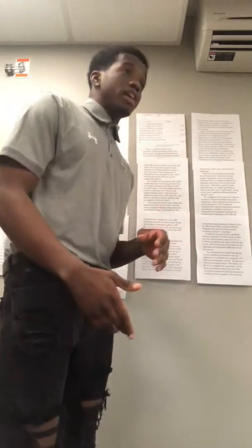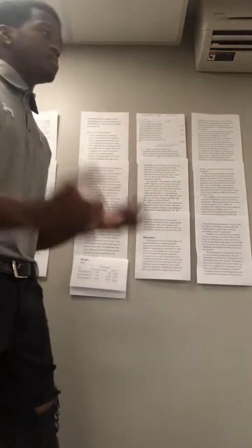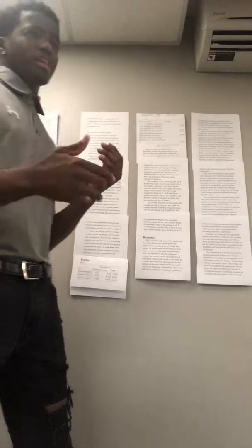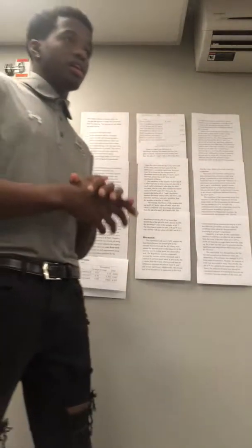That means when it's above 0.05, it is not significant. I'm thinking this may have happened because of the large variability in our sample for pH 8, or the difference of absorbance between the two sets of data samples at pH 7.